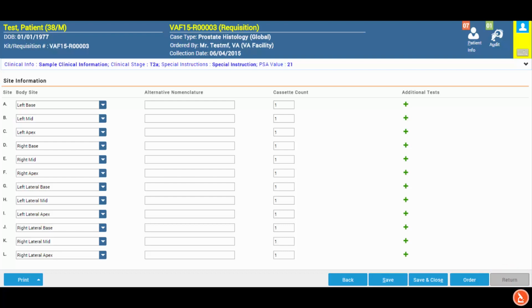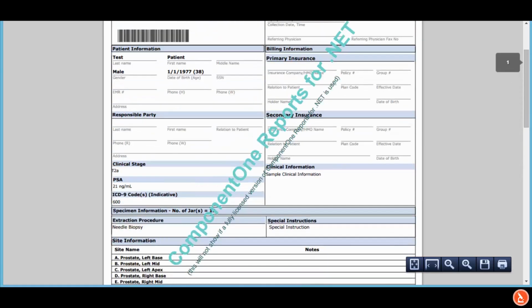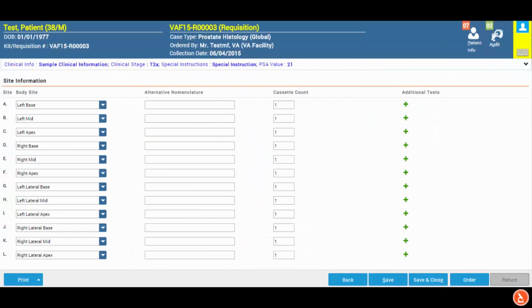You can print your filled out requisition by clicking the Print Requisition button. You can manually print out the jar labels for each jar, which will contain the 1D or 2D barcode, the patient name, specimen location, and physician information. You will need to have Vital Desktop, the printing solution by VitalAxis, to print labels. Please talk to your laboratory to get one installed at your practice.